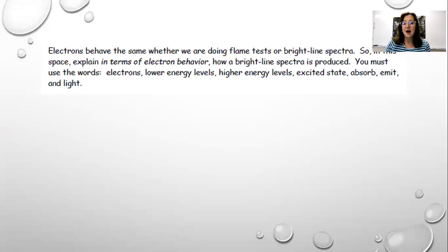So again, I hope that you get to see this in person someday, but in the meantime, get this lab written up and be excited for what's coming next in chemistry.